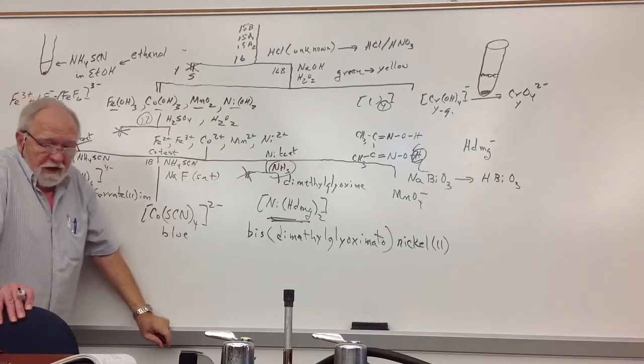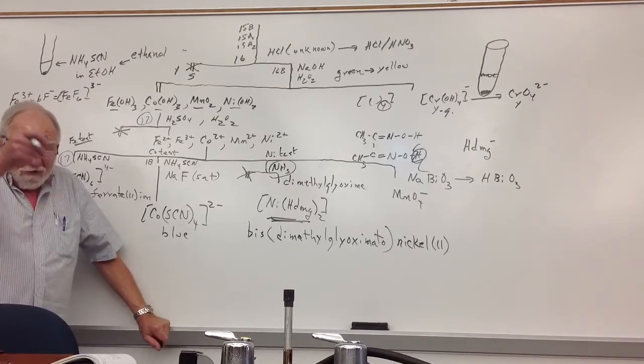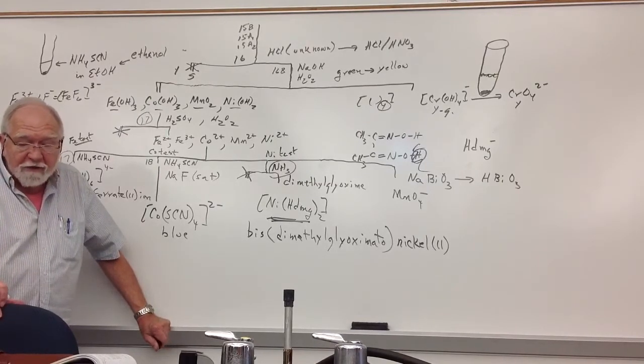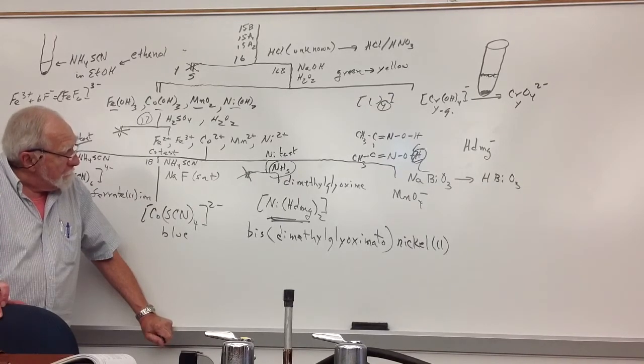Notice wherever it says boil gently for a minute or two, it's usually to decompose the hydrogen peroxide. And it means you're holding the casserole way above the flame and it's just barely bubbling in your casserole. You don't want to evaporate everything away, which is the most common thing people are bringing up for me to see. Okay? So I'm going to stop here.